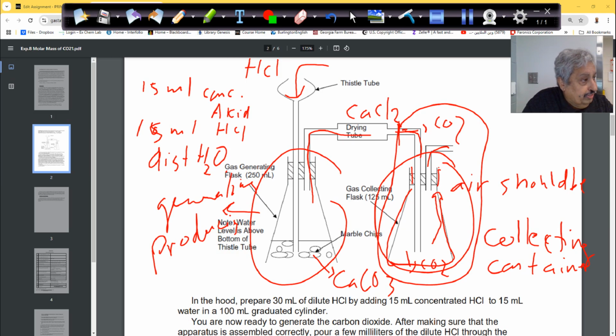Now the weighing. When all the CO2 is out, we'll come and fill the whole thing. The whole setup has to be weighed with the tubing, the tube here and the tube here, up to here, not this other stuff, but from here. It has to be weighed first empty, after you dry it from acetone, get it from the oven, and keep it cool a little bit.